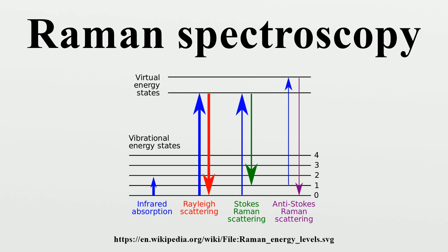Theoretical basis. The Raman effect occurs when electromagnetic radiation impinges on a molecule and interacts with the polarizable electron density and the bonds of the molecule in the phase and environment in which the molecule finds itself. For the spontaneous Raman effect, which is a form of inelastic light scattering, a photon excites the molecule in either the ground rovibronic state or an excited rovibronic state.